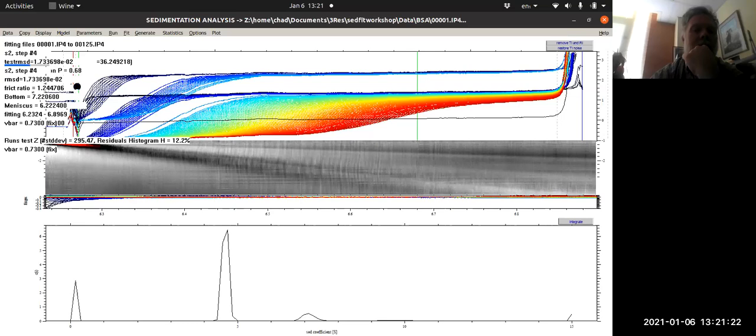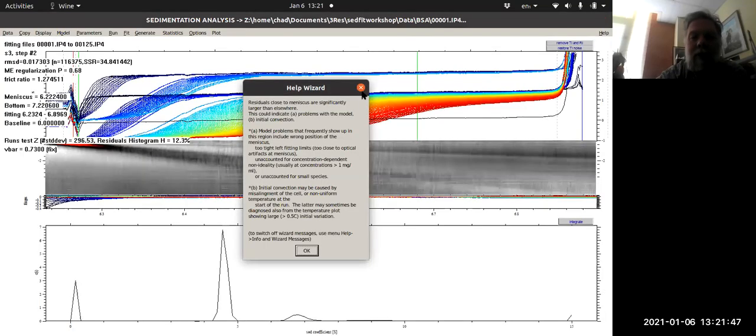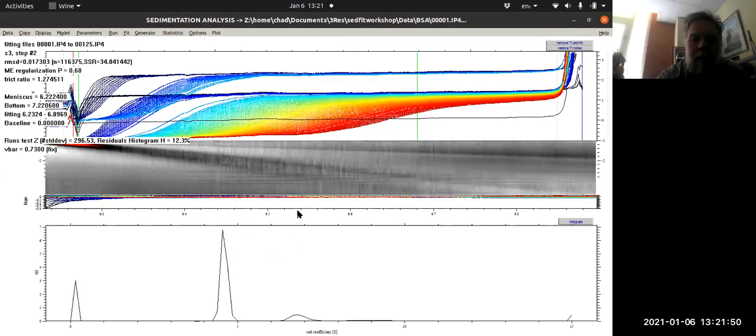So it usually fits fairly quickly. I think this one fits to a frictional ratio that's like 1.3 or 1.27. We'll see where it ends up actually being. It might take a little while to get there. Once we fit the frictional ratio, you'll see this allocating memory space. It'll do all this calculating normal equations, blah, blah, blah. It's fit a frictional ratio of 1.27. The RMSD is a little bit down.